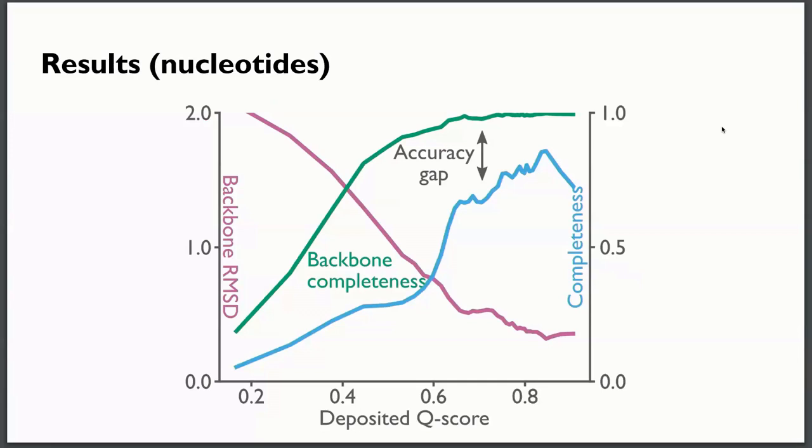is not 100%, which is potentially because there's just not much information when we want to do the HMM alignment against nucleotide sequences, because often all you can see from the map at these resolutions is whether something's a purine or a pyrimidine. And that just means that for each residue, there's one bit of information, and that's not enough to do a high likelihood alignment against the sequence.